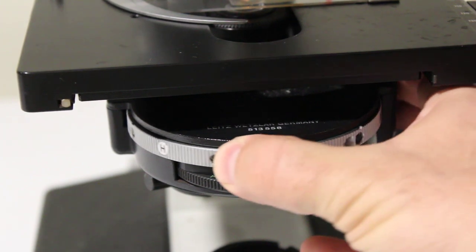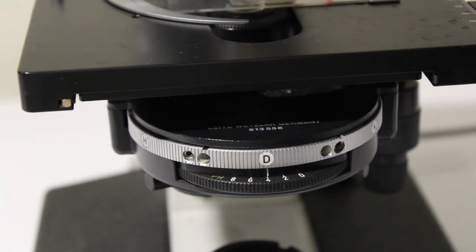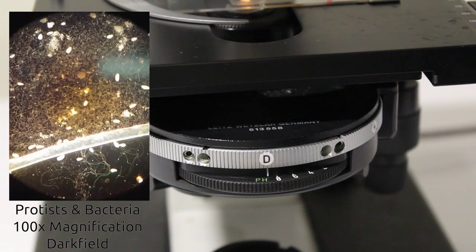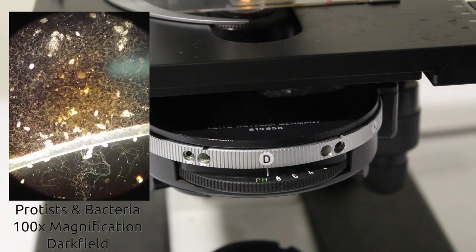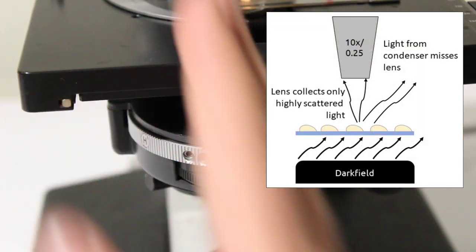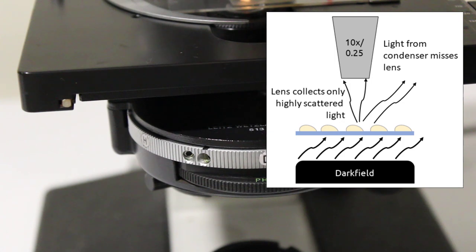The first of these is this one here indicated by a D which is dark field and this is a special type of imaging which basically allows the sample to show up as bright points on a dark background. This is achieved because this is directing light into the sample at a steep angle so it has to reflect off the stuff to be collected by the lens.